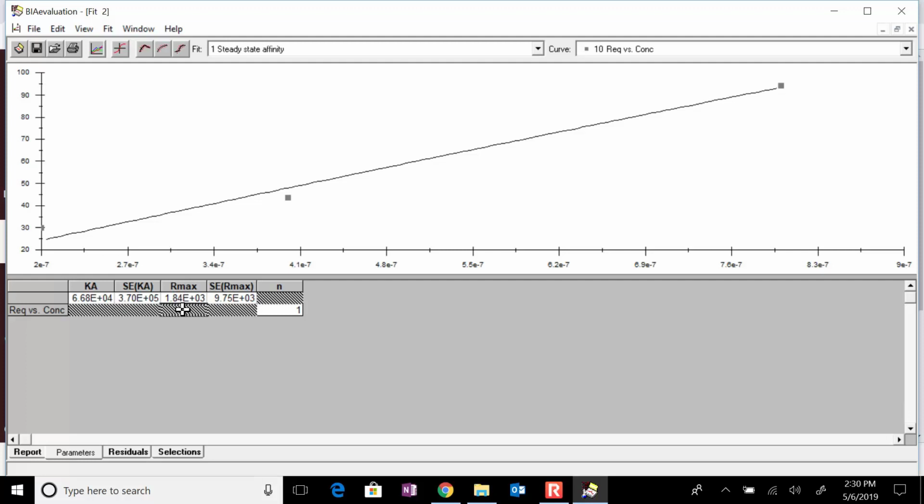But at the end of the day, it's close to working, and you might have a few cases where your replicates just don't come together. I mean, try stuff. Let me know what you see. My judgment from looking at things is I think that we've all got good enough data, and this is when we were just trying stuff. This is everybody's first injection on this. So I want you to do graphs like this, except I would like them to have 3 to 5 data points, hopefully 4 to 5 in each case.